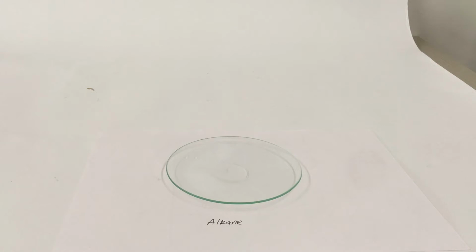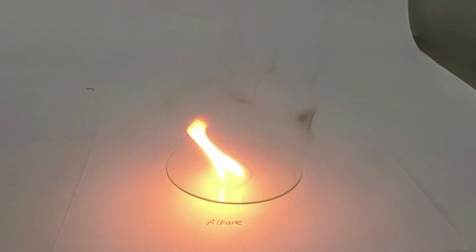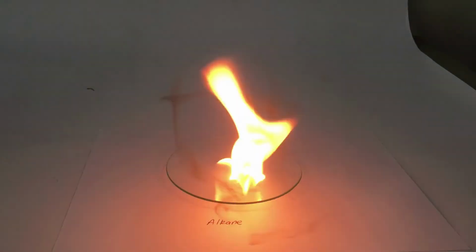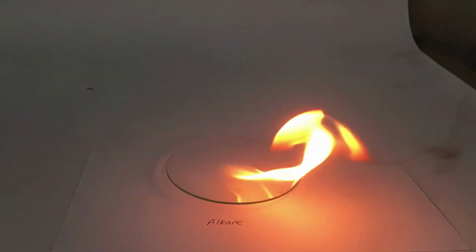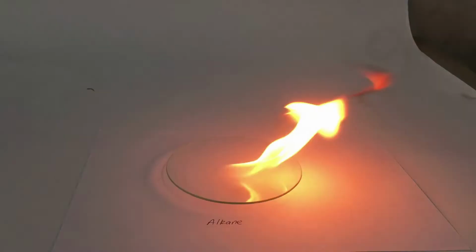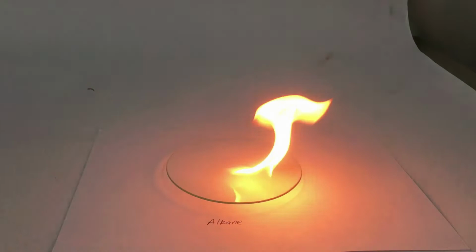Okay, so I'm going to try a few combustion reactions as well. So I've got the alkane here. Now, as you can see, a lot of dark smoke coming off the alkane.